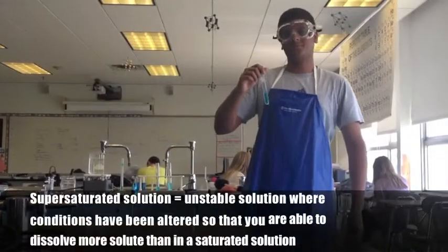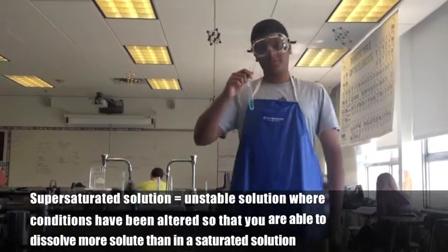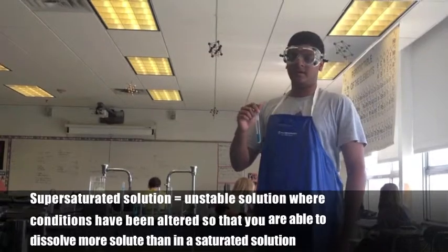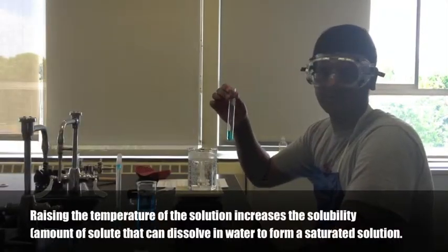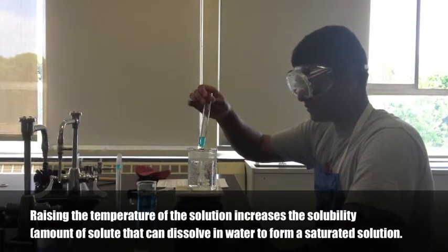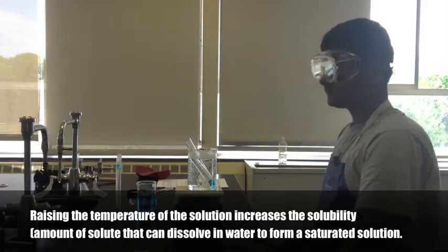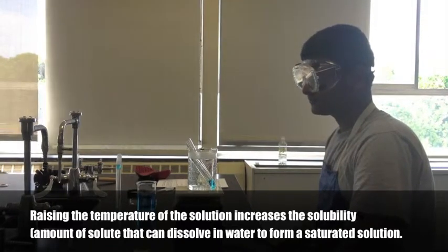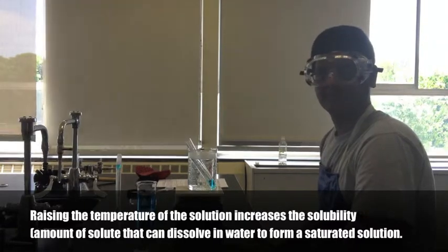The next step in the process is to create a supersaturated solution by placing the saturated solution in a hot water bath. Here is the saturated solution, which we will put into the heated water bath and put to boil for 2 minutes.